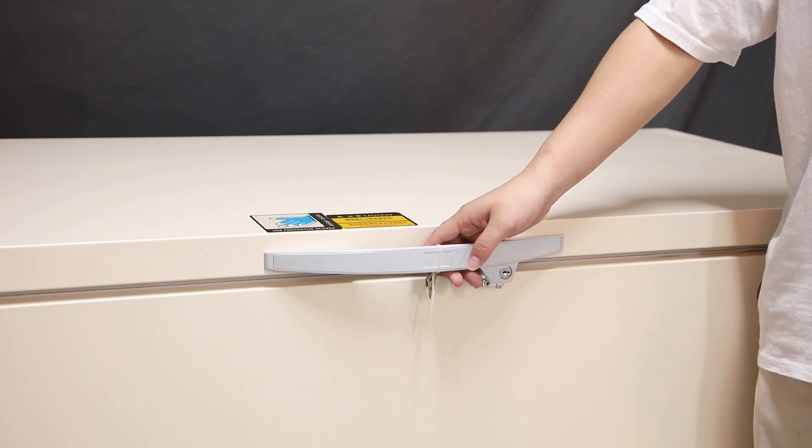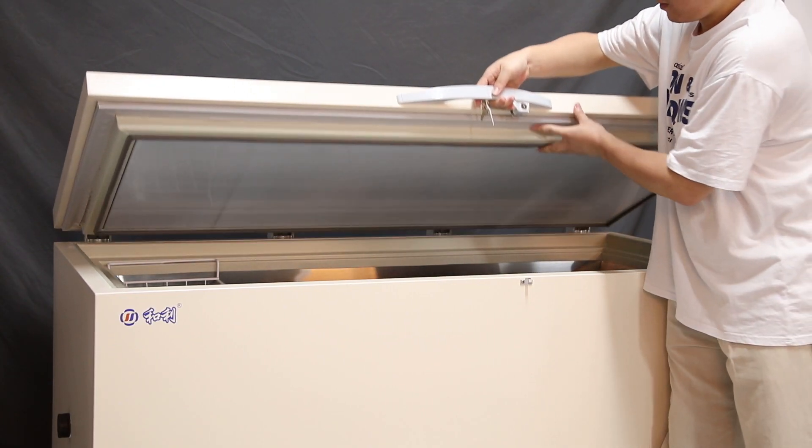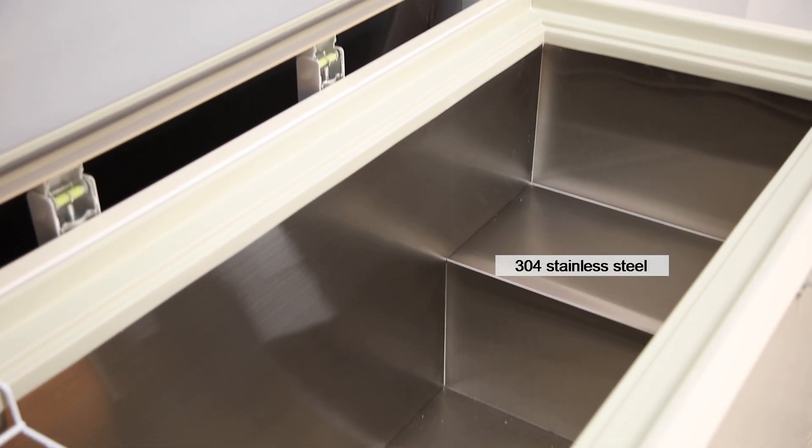Super thick foam layer and double seal design effectively protect the temperature inside the box. Using food grade 304 stainless steel and fluorine-free environmental refrigerant. Perfect alarm system.